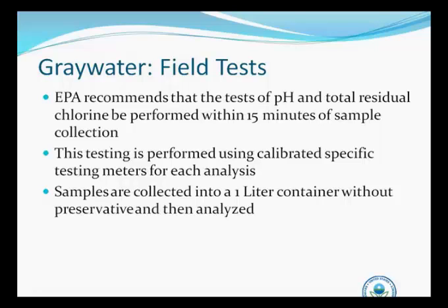For chlorine, generally they're using what's called the DPD method of test for chlorine, and there's a powder that's added to the sample that turns pink in the presence of chlorine. These meters generally have a fixed calibration, so you'll just be doing tests and these meters will kick out a number that gives you a level of chlorine. But if you do see results for chlorine that are quantifiable, there should also be a pink color that's associated with that.